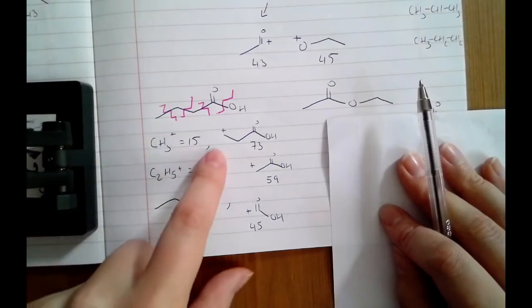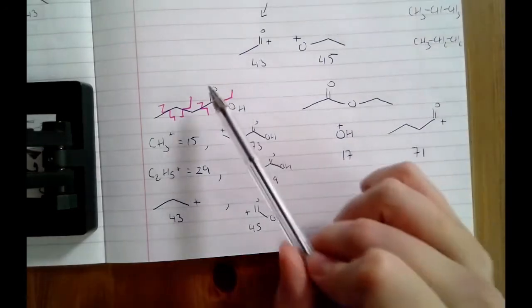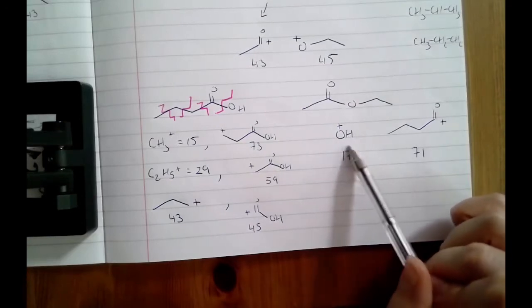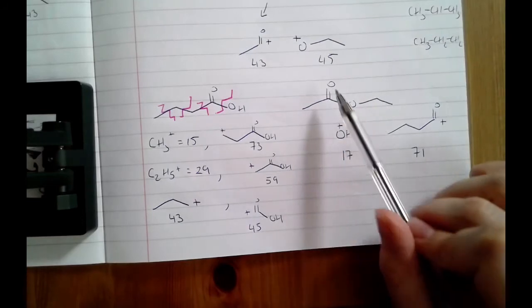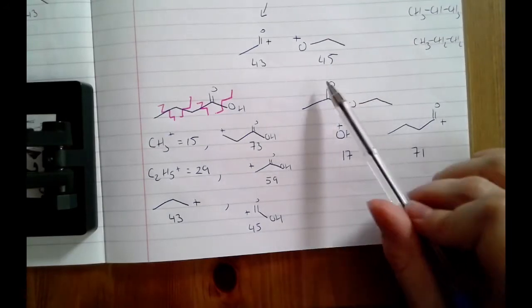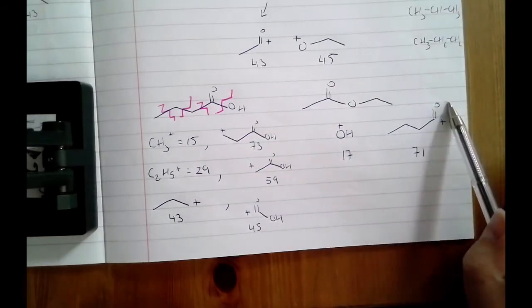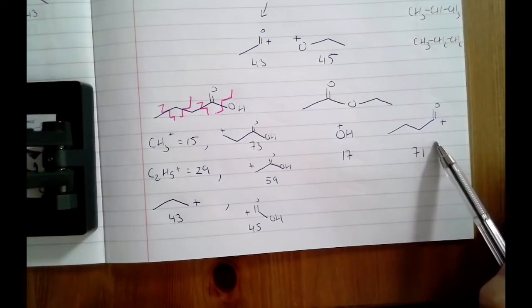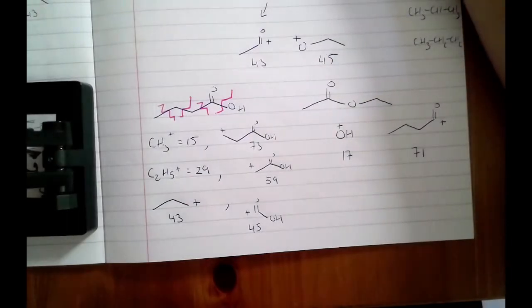A peak that's unique to your carboxylic acid, however, is your OH, okay? If I were to break this final bond here, I would remove an OH. Oxygen has a mass of 16, hydrogen has a mass of 1, gives me a peak at 17. If I look at my ester, I can't remove an OH. There are no hydrogens bonded to the oxygen, so I'm not going to have a peak at 17. And if I can't remove a fragment with a mass of 17, then I'm also not going to have a fragment with a mass of 71, okay? The total mass is 88. If I remove 17, I'm left with 71, and that will be this fragment here. And both of these are unique to butanoic acid.